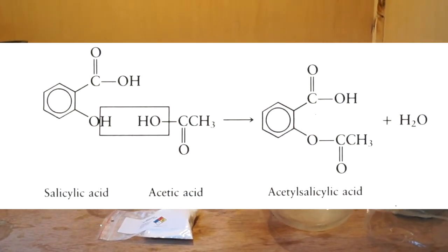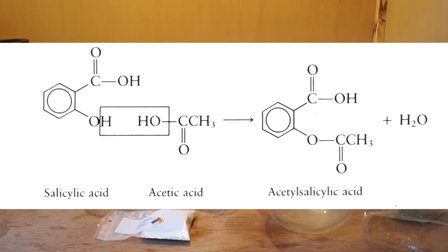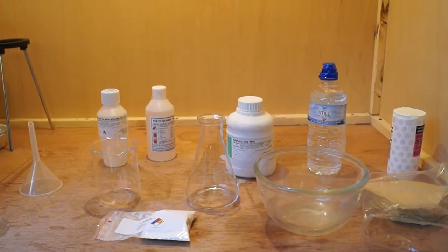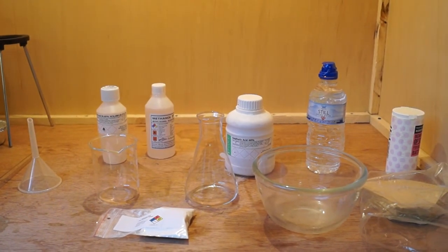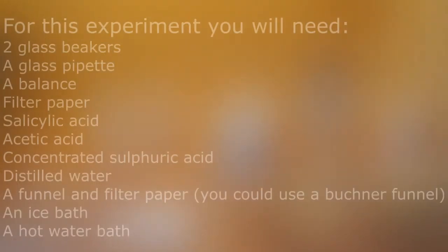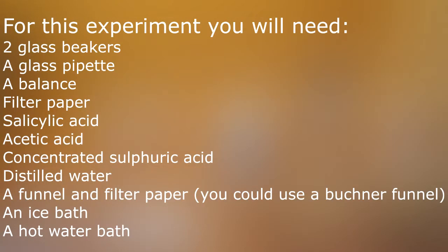In this reaction I will be using sulfuric acid as a catalyst. I always like to have a base on hand to neutralise any acid spills — I am using sodium bicarbonate. For this experiment you will need 2 glass beakers and a glass pipette.